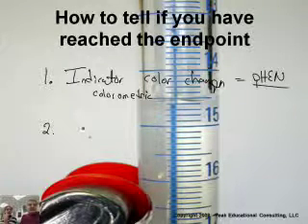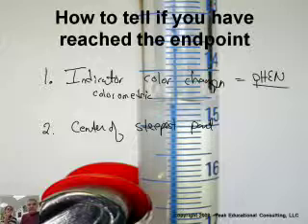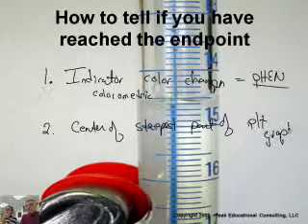The second method is by the center of the steepest part of a pH graph. Yes. So another way you can do it is if you're graphing your data as you add the other reactant as you go through your titration. If you collect all the data in terms of how much you've added and what the actual pH is, you graph that and then you look for the steep spot, which we'll show you here in just a minute. So let's take a look.